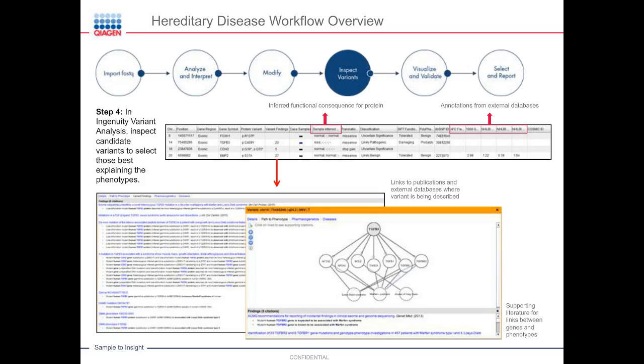Otherwise you would use Google Scholar or the NCBI search and check in what kind of gene the variant is present, and then look whether that gene is associated with any other gene. Of course it would be very time consuming. I have talked with some people who were working on one of the cases for weeks or even months to come up with a good candidate.